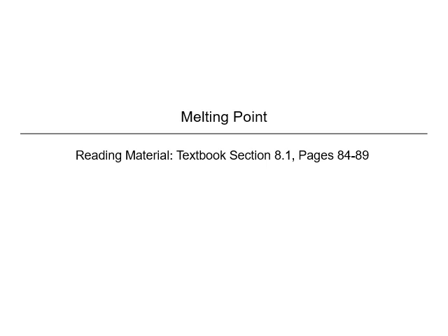Welcome to week 2 of your organic chemistry lab online. And this week we'll be discussing melting point. For your textbook and reading material, we want you to cover section 8.1, which encompasses pages 84 to 89.